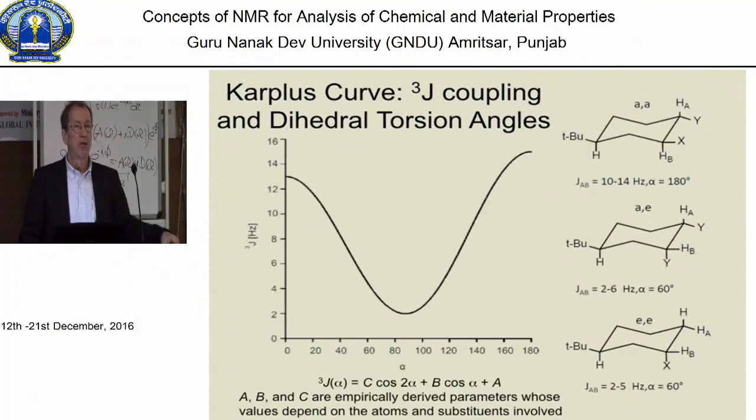crude oil with these well logging tools by doing a double resonant proton carbon experiment to measure heteronuclear J couplings, to get information about the value of the J couplings, so that they learn something about what type of oil is underground by a chemical analysis, which is rather interesting. And this is something that probably will be exploited more in the future, to study J couplings with simple NMR tools to derive chemical information.